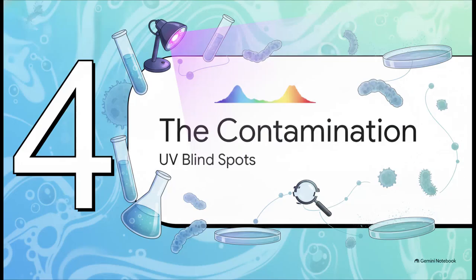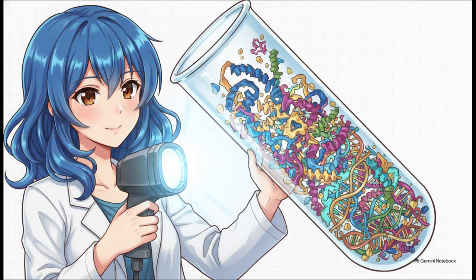Section 4. The contamination complication. But of course, here is the massive plot twist in Dr. Chem's experiment. The biological soup we actually extract this DNA from, it is a chaotic mess. Proteins absorb light super strongly at 280 nanometers. Salts and organics, they hit at 230. But the real kicker here? RNA absorbs at 260 nanometers. Yep, the exact same wavelength as our target DNA. These are basically invisible hijackers just hiding in the light.